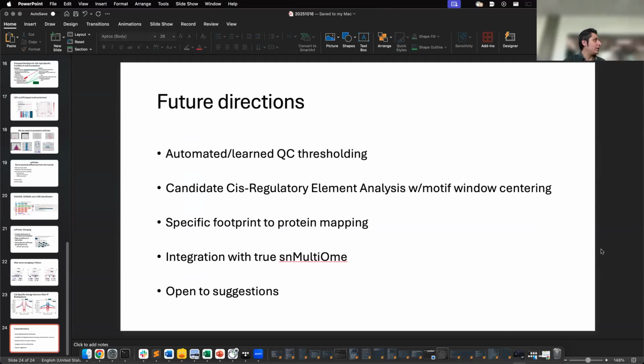For me, there's a strong argument to be had for moving into the Python framework, and SnapATAC is, in my opinion, one of the better ways of doing that. So nothing wrong with ArchR or snATAC. Those are really powerful technologies. It's just that if later on I know I need to move into multiome, I think this is the better tool for the job.